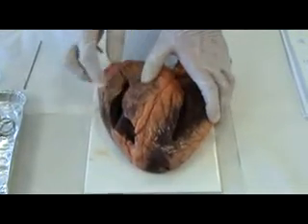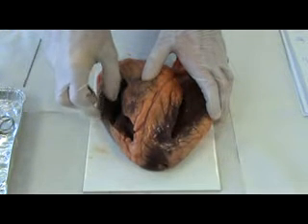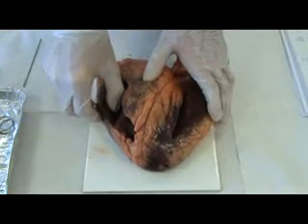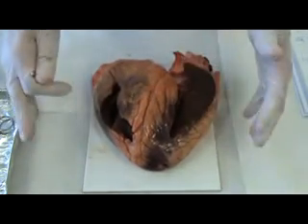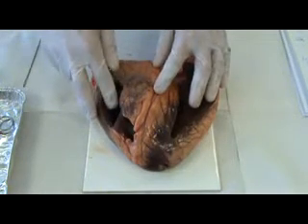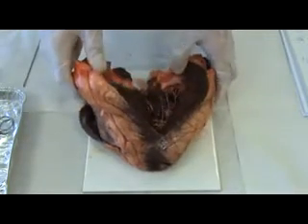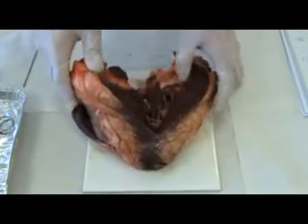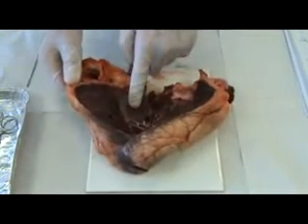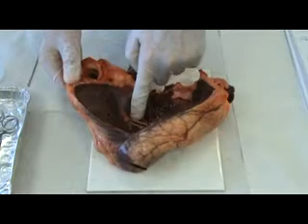The right side of the heart has to pump blood to the pulmonary circuit, so blood back to the lungs, and as the lungs are next to the heart, it's a shorter distance, hence less power is needed. So if we open up the heart there and look at some of the chambers, and if you put your finger on there, notice how smooth the chamber is.